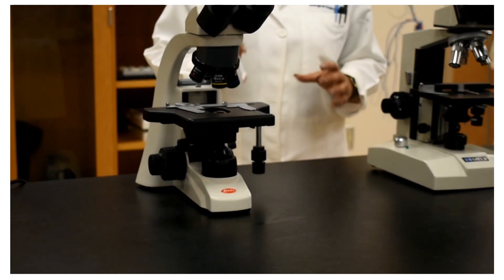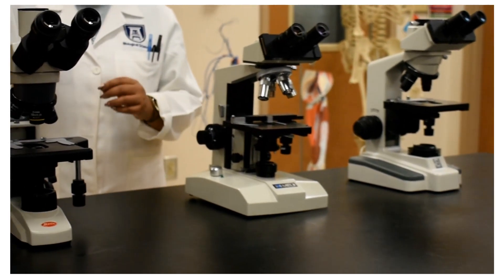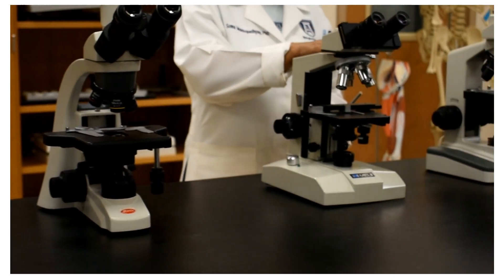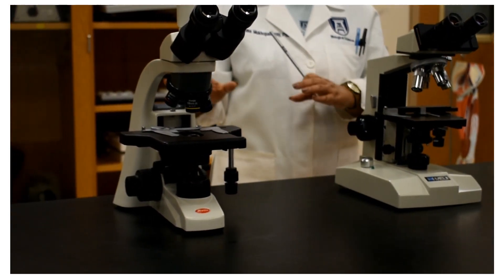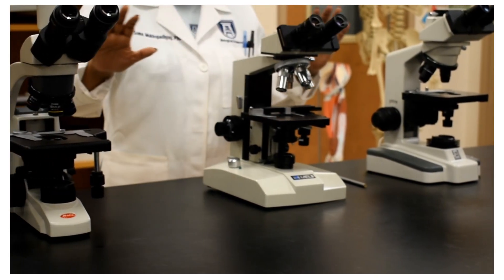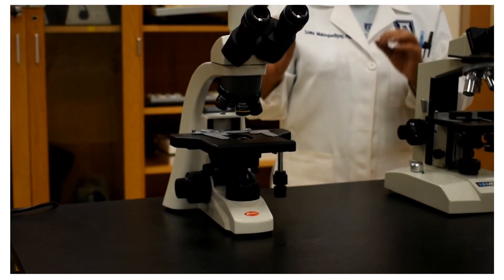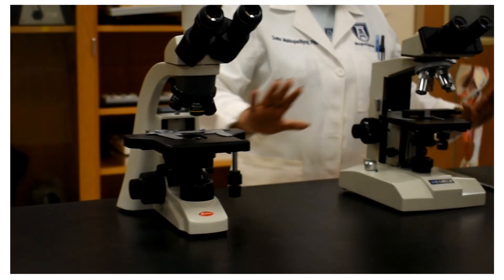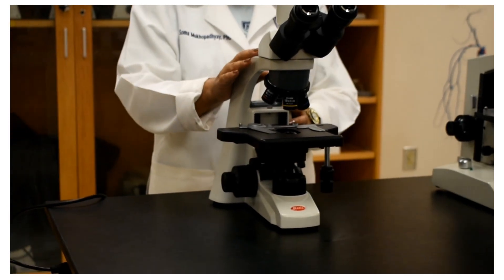After the microscopes are plugged in and placed on the table, we will turn on the light switch because we need the light source. I have three different microscopes. Most of the parts are the same from one brand to another, but there are slight differences among different companies or models regarding where the light switch and brightness control are located. The first one I have here is from Motic.